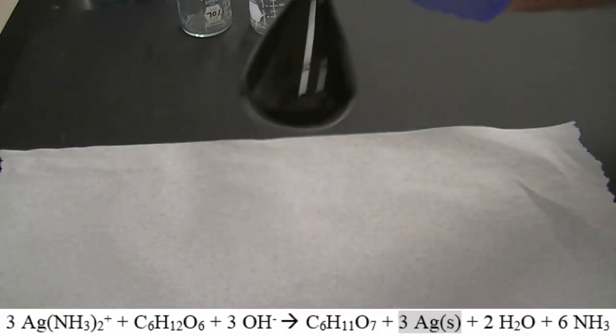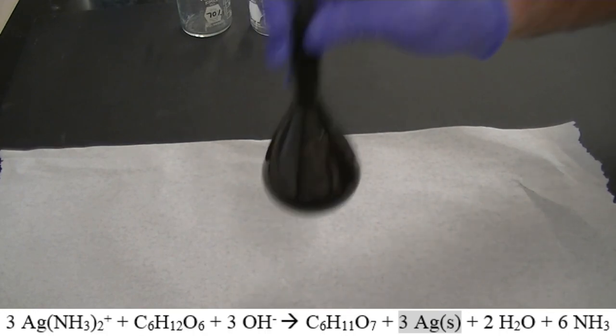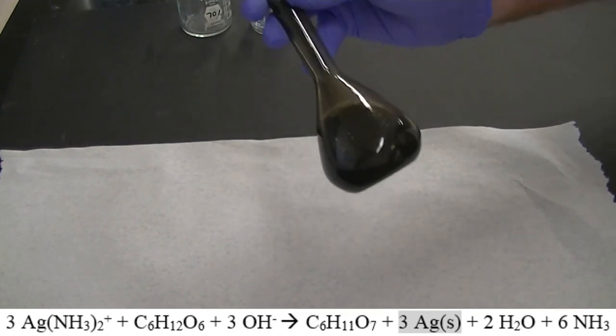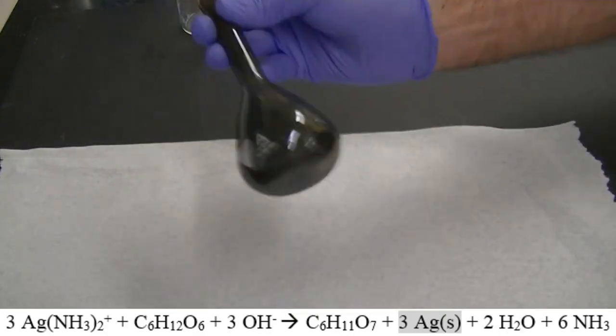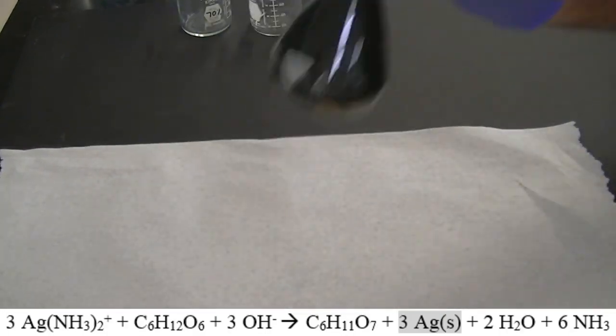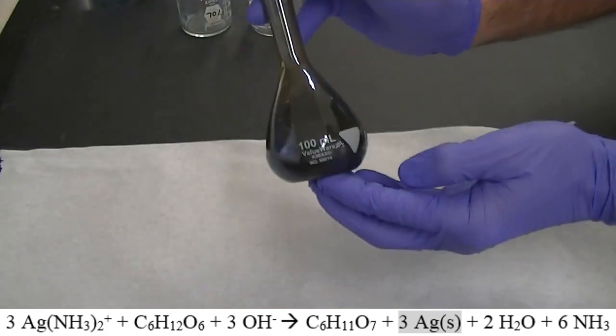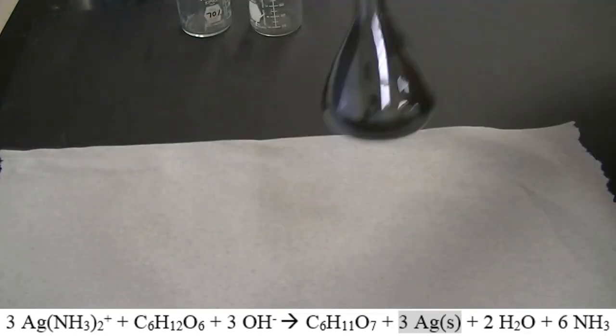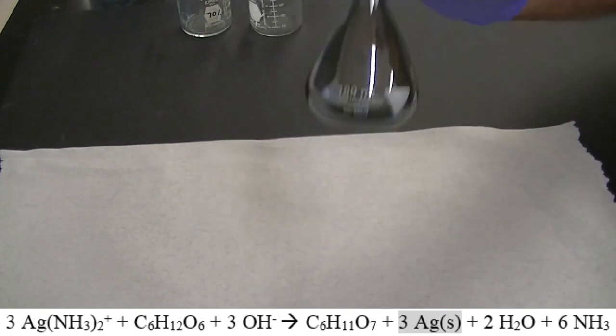The silver complex reacted with the sugars in the Powerade to form silver metal. The reaction mixture always looks dark and cloudy at first, kind of like a storm cloud. I think this is really interesting because this reaction reminds me of the saying that every cloud has a silver lining.